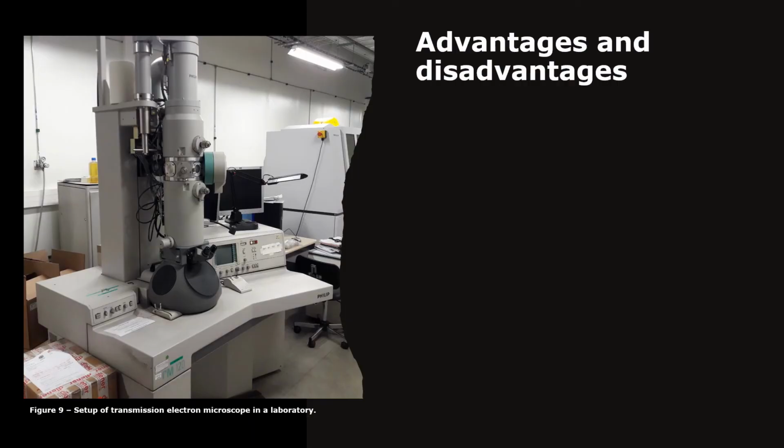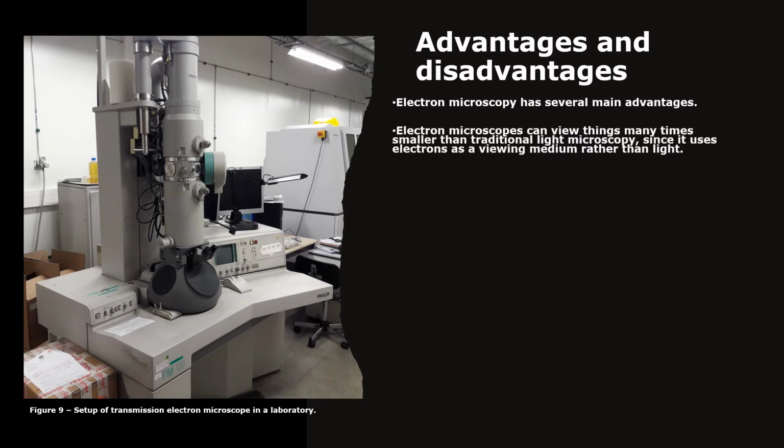Having had an extensive look at the operation and imaging of the types of electron microscopy, it's important to consider the advantages and disadvantages of these techniques. To start with, the main advantage of electron microscopy is the main reason for electron microscopy. It can view things many times smaller than can be viewed through the light microscope. By using electrons rather than light, we can view things 500,000 times smaller than with the naked eye. For example, bacteria can be viewed through these methods.